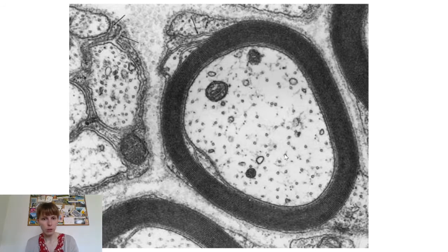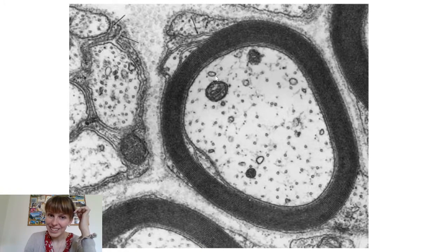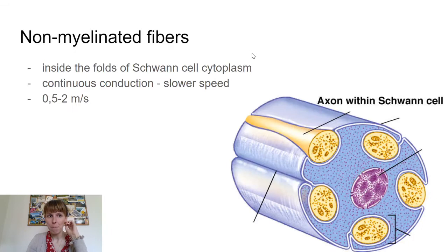So we talked at the beginning about axon transport. So along the axon, which we cut through like this, you have microtubules going, and on these microtubules you have the vesicles traveling on motor proteins. So these are the microtubules on cross section. These would be some of the cargo vesicles, probably. This could be a mitochondria. This I'm not really sure. So this would be a myelinated axon.